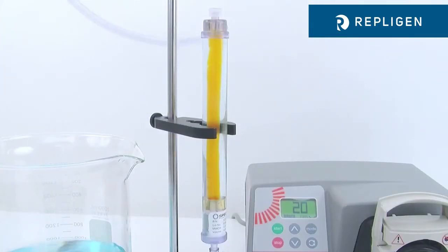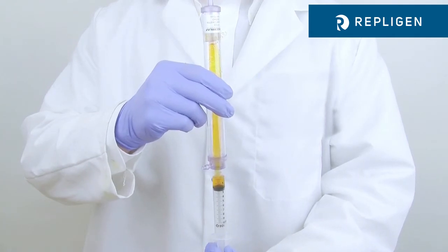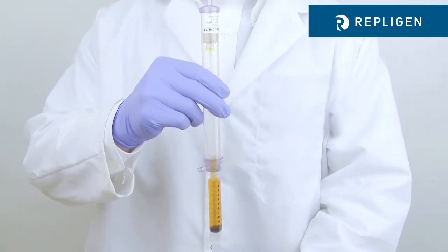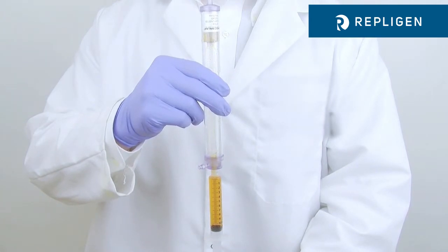To recover the sample, first drain the buffer back to the feed source, then connect a syringe directly to the sample port. Invert and simply aspirate out the entire sample to achieve 98% recovery.